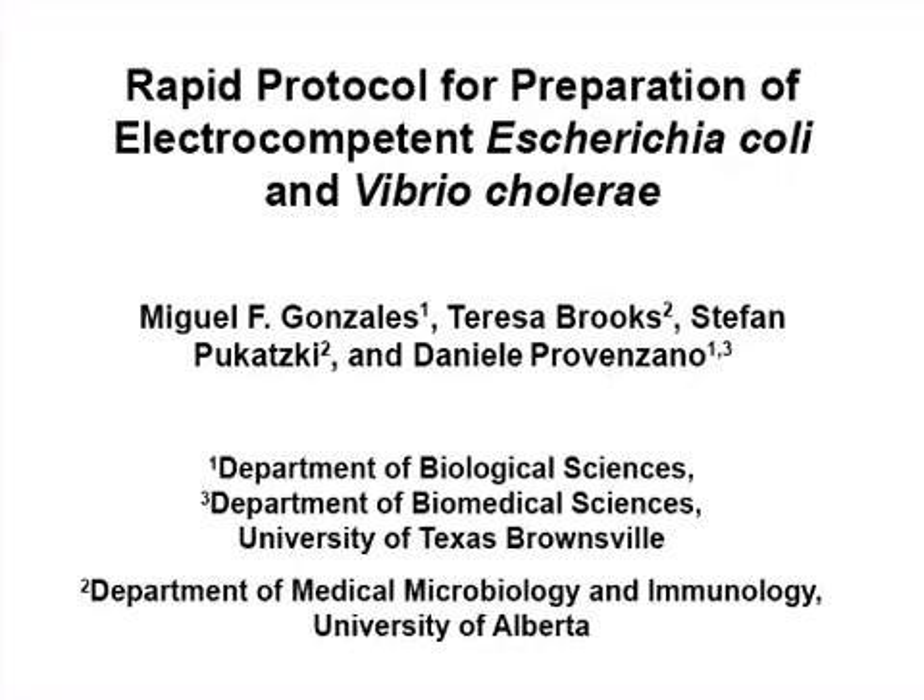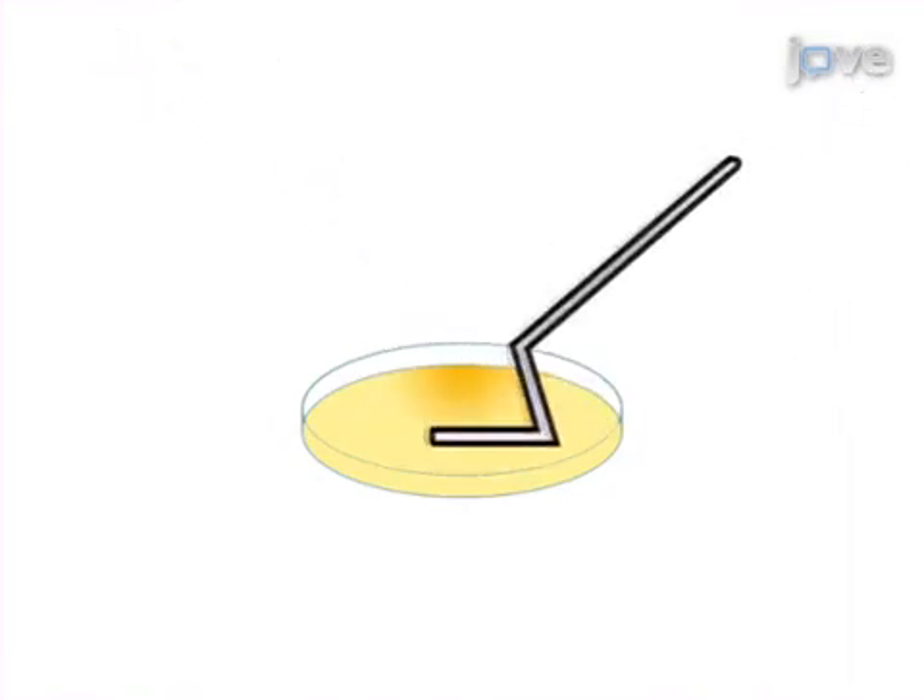The overall goal of this procedure is to generate competent bacteria rapidly and conveniently on the same day they are needed for transformation. This is accomplished by first plating the bacteria on LB agar and incubating them for four to six hours. Next, the bacterial lawn is carefully harvested from the surface of the agar and the pellet is resuspended in sterile cold water or buffer.